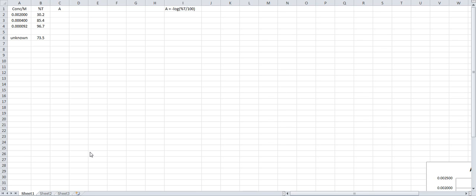This is some data from the spectrometry experiment. In the first column I have concentration in units of molarity. In the second column I have percent transmittance. I also included the unknown under your data of the known solutions.